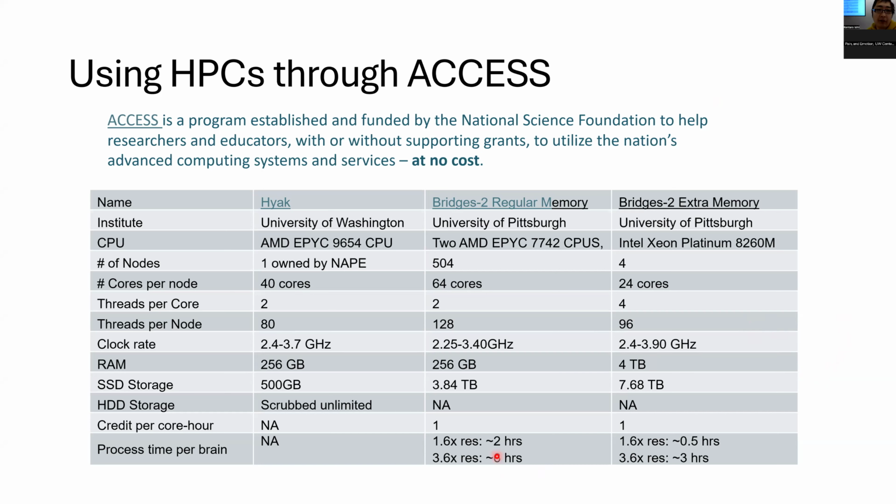Yeah, that's a good question. It obviously depends on your computer. I don't think it will be faster than on your normal computer. Processing one brain on a cluster computer is not necessarily faster than in your local computer environment. Transferring data is a lot faster when it's local. But as I said, you can parallelize that. So processing 12 brains or 20 brains will be a lot faster on the cluster computer.